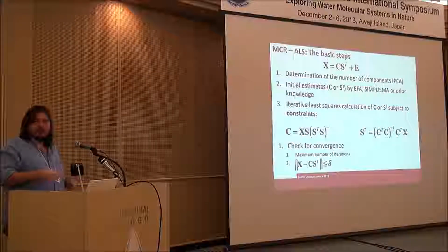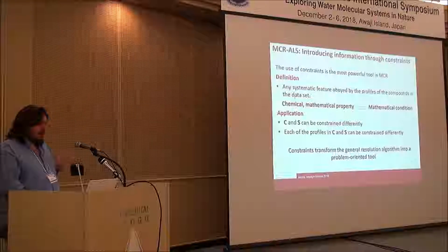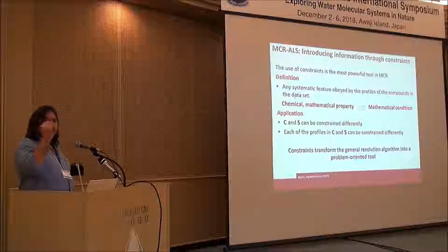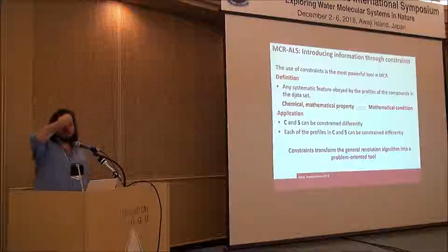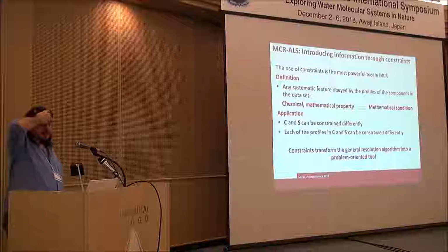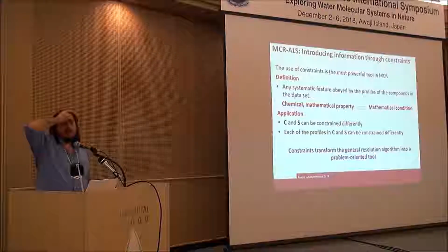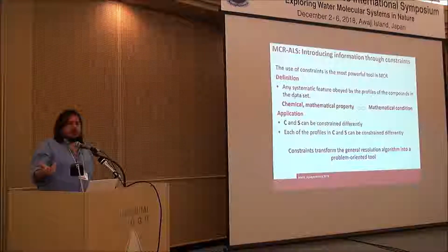And we do back and forth until convergence. So it's also quite easy from an application standpoint. The general idea, and probably the most important concept that you may want to retain from this discussion, is that whatever information we may code into a mathematical constraint would help the actual resolution of our data.